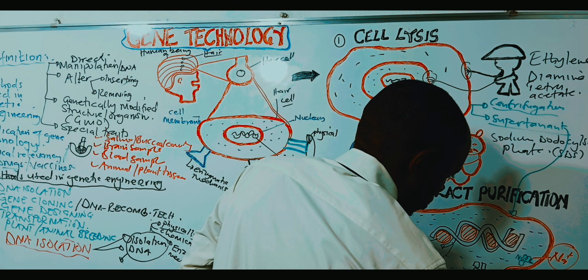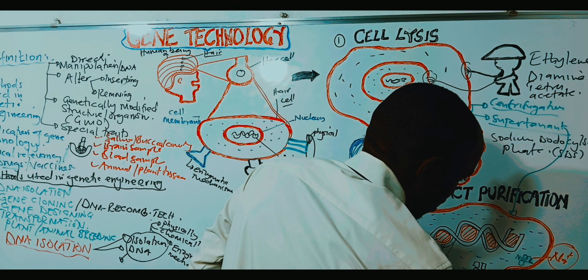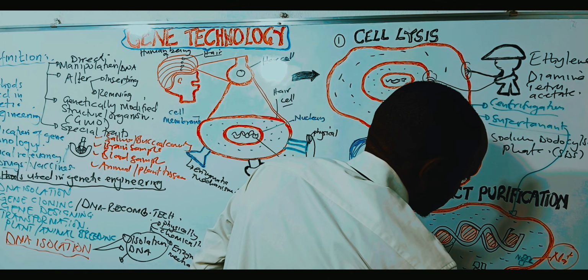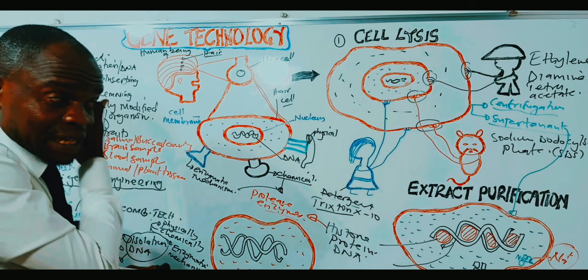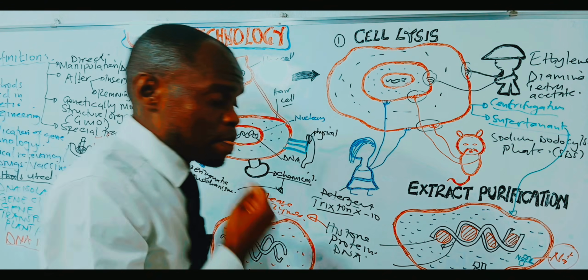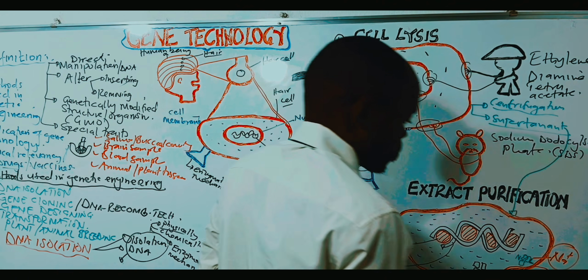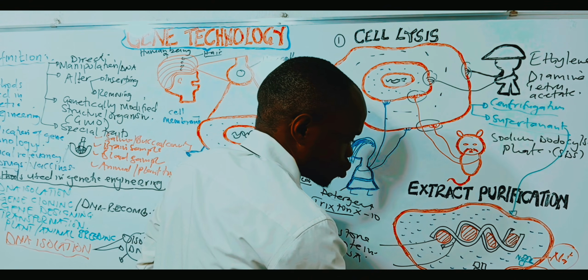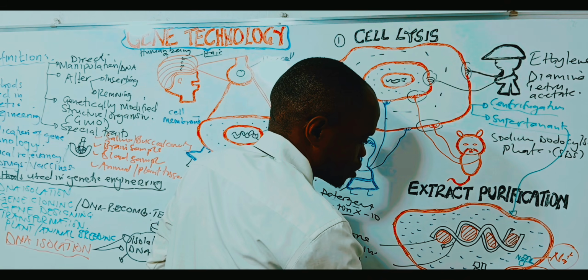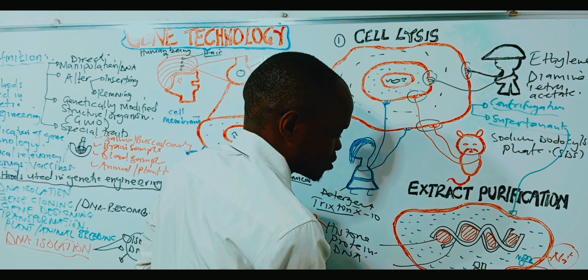Or I have the ammonium acetate. I'm going to put that together there. I'm going to bring that kind of buffer there. This buffer, in a given solution, is going to break down in water to give ammonium ions plus the ethanoate ions, aqueous.